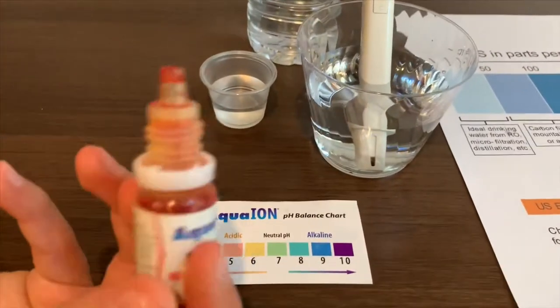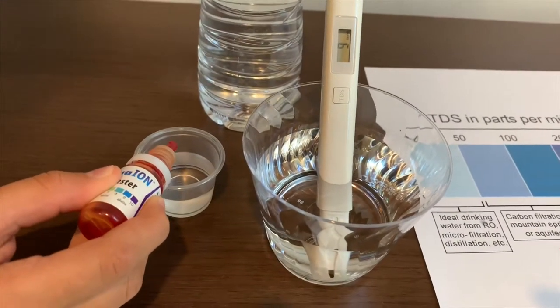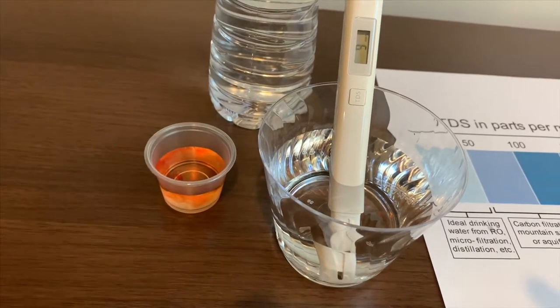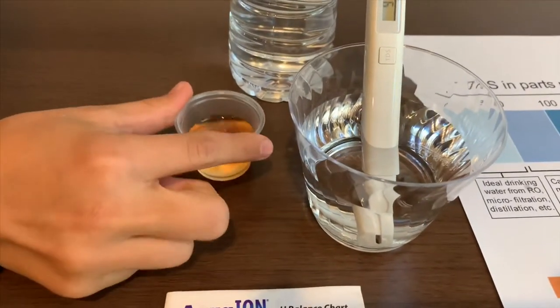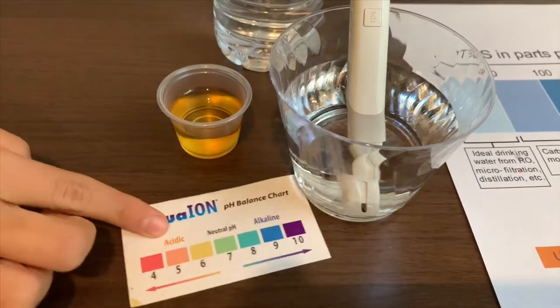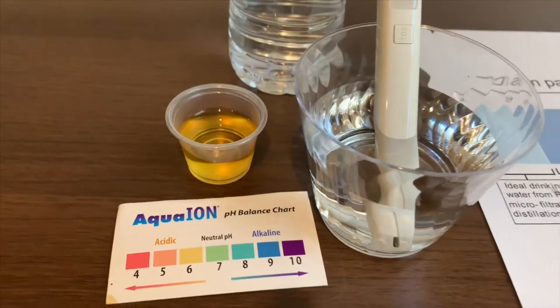Let's test the pH level. I'll say that's a six. That is acidic.